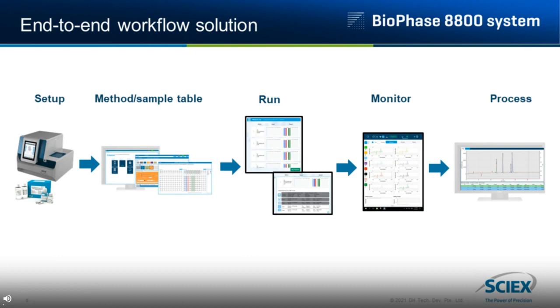Following the sequence development and upload, a map for both sample trays and reagent trays can be printed out, and users take that map and populate the trays and BioPhase instrument with appropriate samples and reagents before moving on to the separation itself. On the front panel touchscreen, the user can recall the sequence and initiate the run.